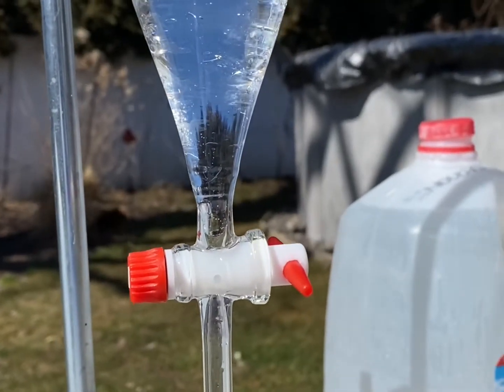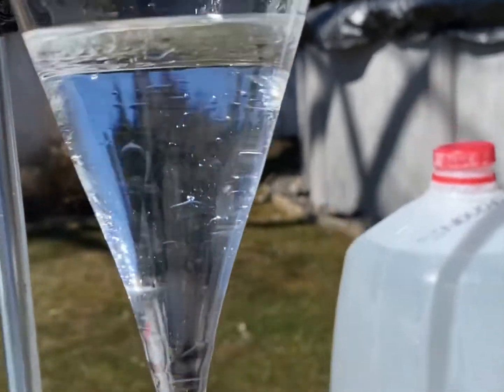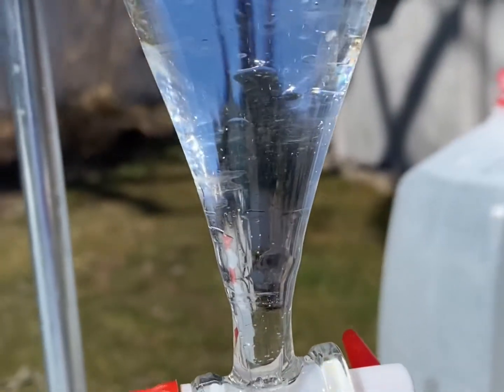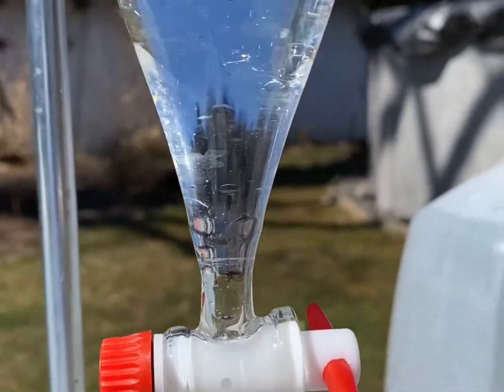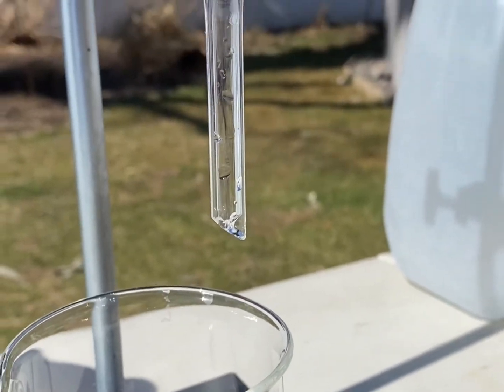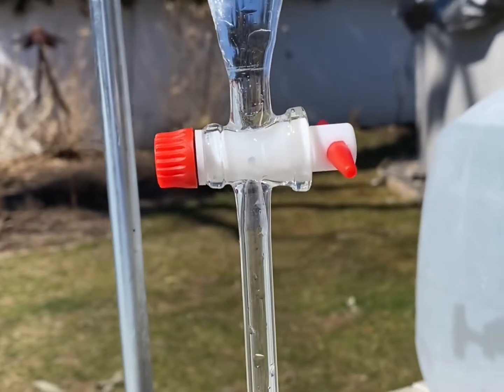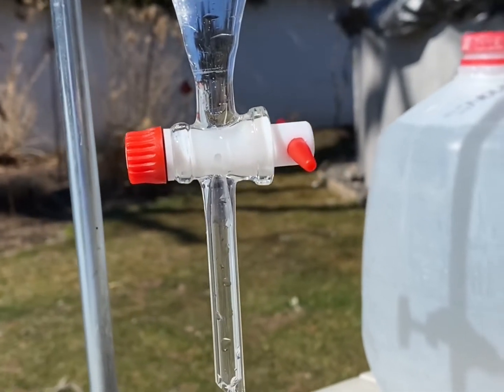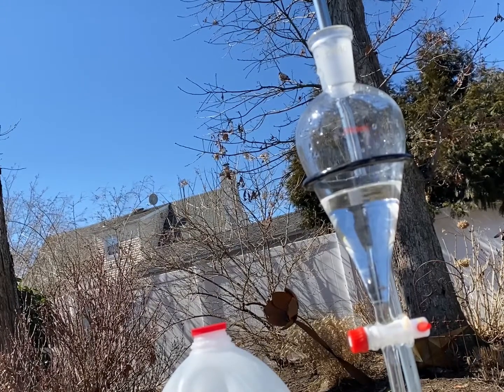Okay, so now we've got the chloroform in the sep funnel. That little layer up there, as you can see, is water. So I got out a lot of water. So this whole portion right here is our chloroform, right? This whole big section right here. So we're gonna empty it out into this beaker, and then we're gonna put the chloroform back into the sep funnel and wash it with some sodium chloride solution. So I'm gonna empty it out real quick and then put it back in, and I'll show you the sodium chloride. Okay, so now we're gonna do the sodium chloride solution.